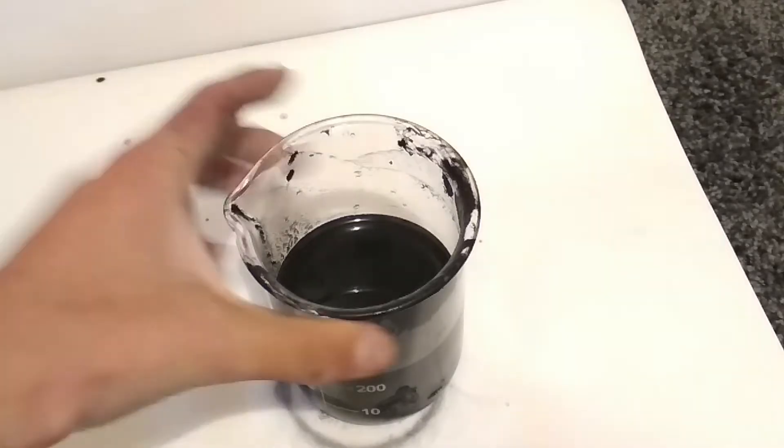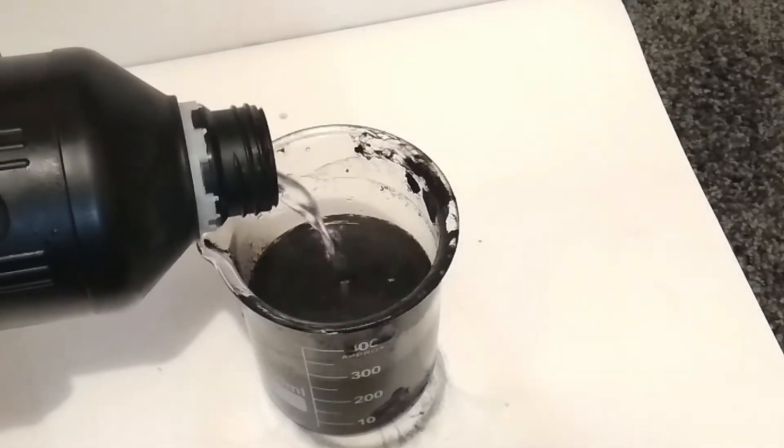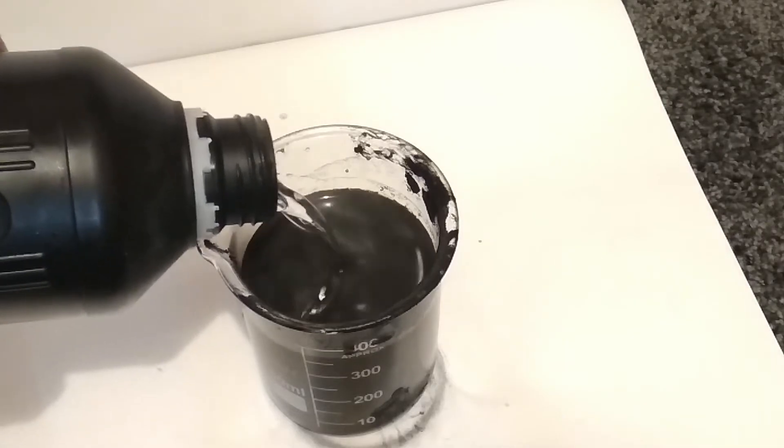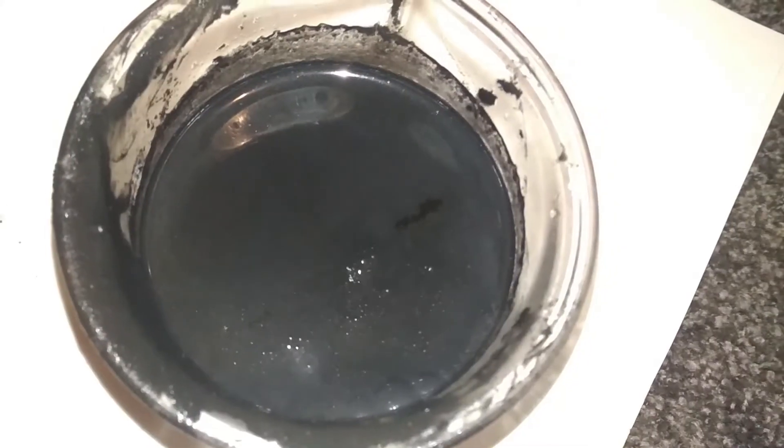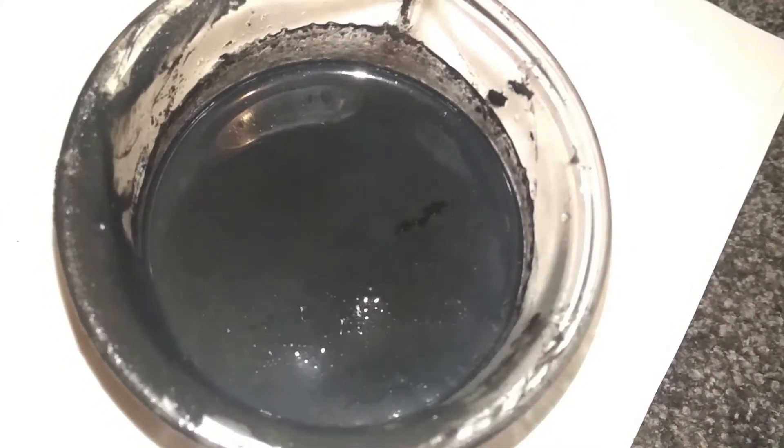Now we can add some hydrochloric acid. This reaction is endothermic so we need to heat it up to get it going. During this process there will be large amounts of chlorine gas being produced, so don't breathe that in.